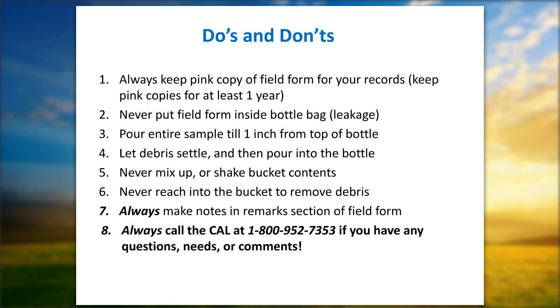Number 6 is a big no-no. Don't ever reach into the bucket to remove the debris, no matter how disgusting. We've had all sorts of odd stuff in our buckets. Don't ever reach in there because you're certainly going to contaminate it or break it up. And then number 7, we've said this, no matter how trivial you think it is, we do read all of your comments. Jeffrey and Brian read each of them. They get keyed in by someone.